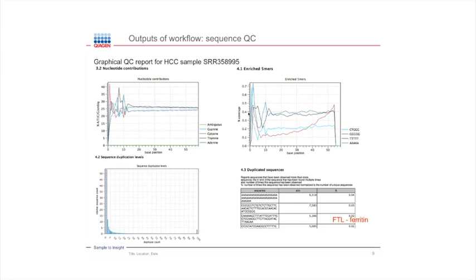And you can see that in the top right plot with the set of enriched 5-mers. This is a rather nice plot. It shows you if there's some real bias in your data. In this case, there isn't.